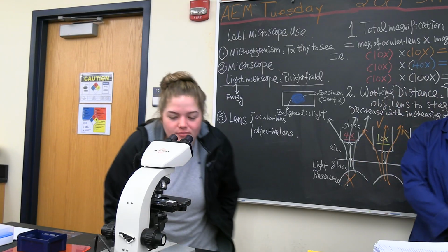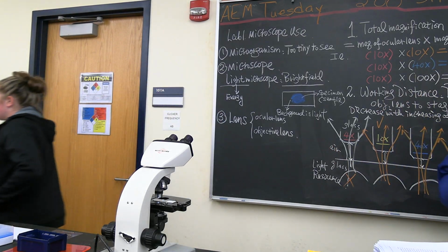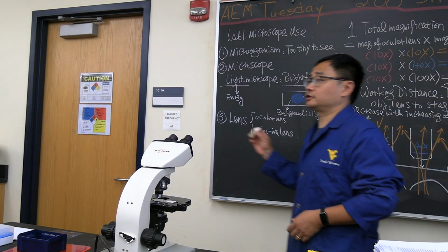Three representatives from the whole classroom. Is that good? Yes. Okay, but you won't see anything. So we need to do the next step, which is called oil immersion. I don't know whether we have enough. Wait a second, we need to get oil. We want to see the morphology, so we need oil immersion. So grab the oil.